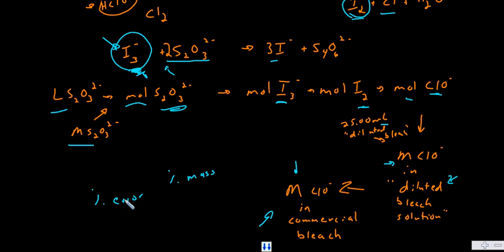So this is kind of like our titration that we've done before, except a lot more complicated and a little bit different because it's a redox titration, not an acid-base titration.